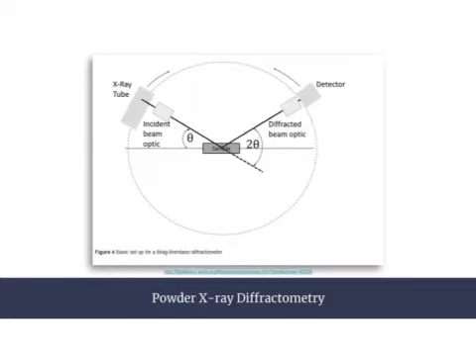On a more scaled down approach, this is what the Bruker machine is doing. How it's set up is on our left, as I mentioned, we have our X-ray tube, or our emission source, that kind of rocks back and forth on a circular path. This allows us to change the incident beam optic angle, which we can see right here, and that's the angle that's impacting on our sample. From here, the sample then reflects or diffracts the beam into our detector.